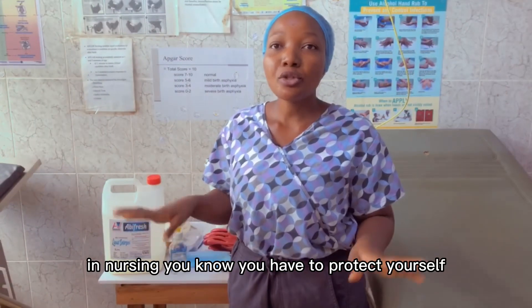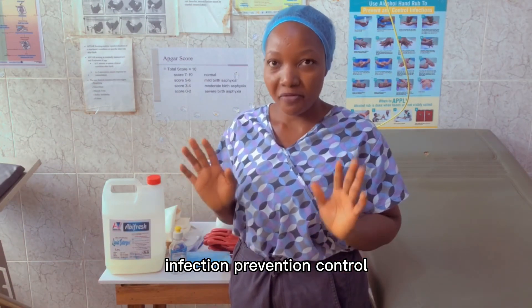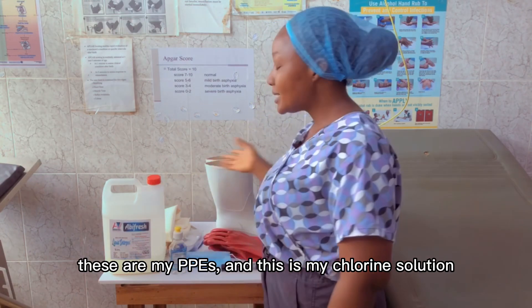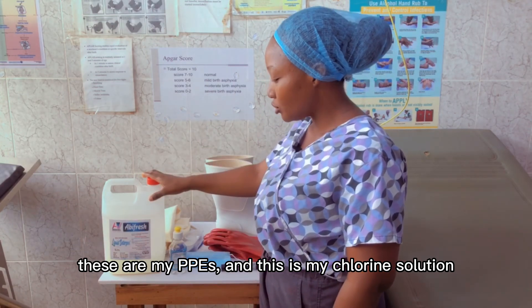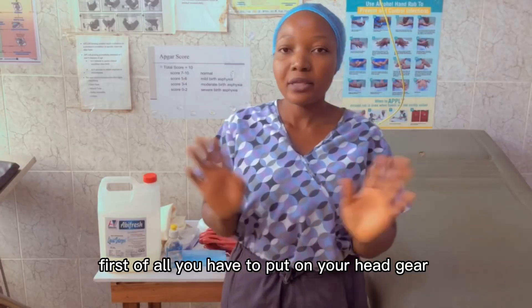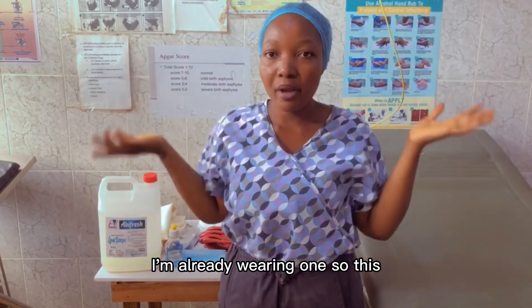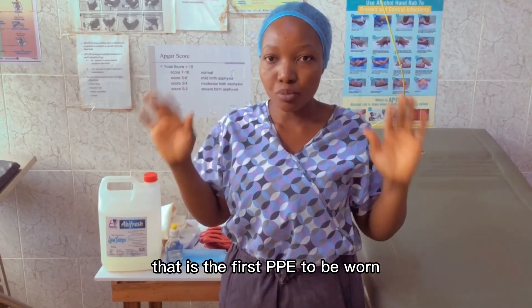In nursing, you know you have to protect yourself — infection prevention and control. So you have to put on your PPE. These are my PPE, and this is my 3.5% chlorine solution. First of all, you have to put on your head gear. I'm already wearing one, so that is the first PPE to be worn.